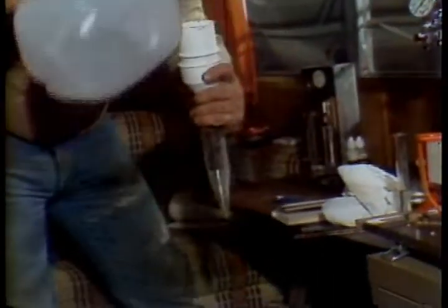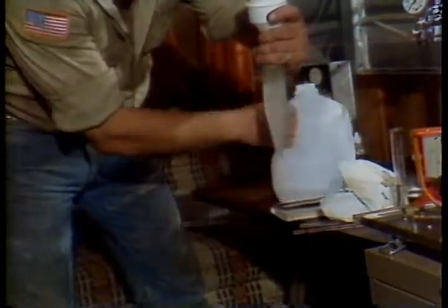Now I'll put it on a small funnel, put it back on my glass tube, and run more water through it. Sand is harmful to all moving parts in the system, especially the mud pumps, so this has to be watched carefully. Now we'll read the sand content, which is marked from 0.25% all the way up to 20%. And in our sand on this location, we're showing 0.25% sand in our mud, which is a very acceptable level.